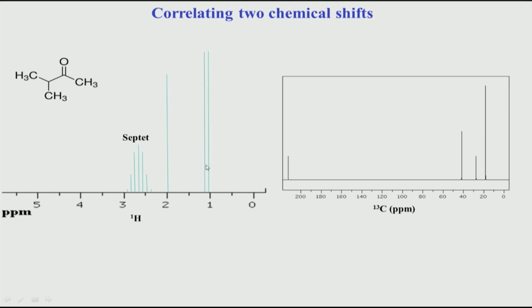Of course, if you use a logical idea, you can say that this will correspond to this and this will correspond to that and so on, but that is based on some kind of logical argument. But if I want to directly see which proton peak here, let us say one proton peak, because this together is 1 and this is a doublet, this is 1 and this is another 1, a bunch of peaks corresponding to a J multiplet. So, this particular peak corresponds to which carbon here?